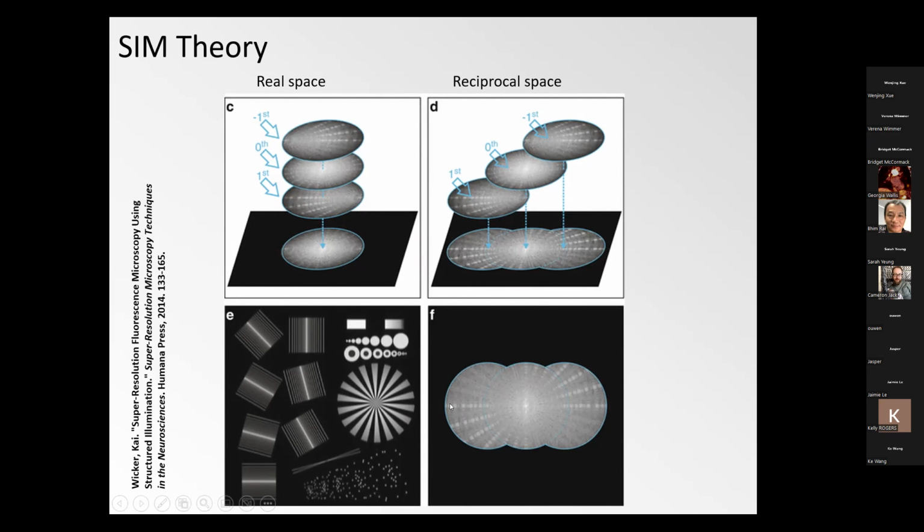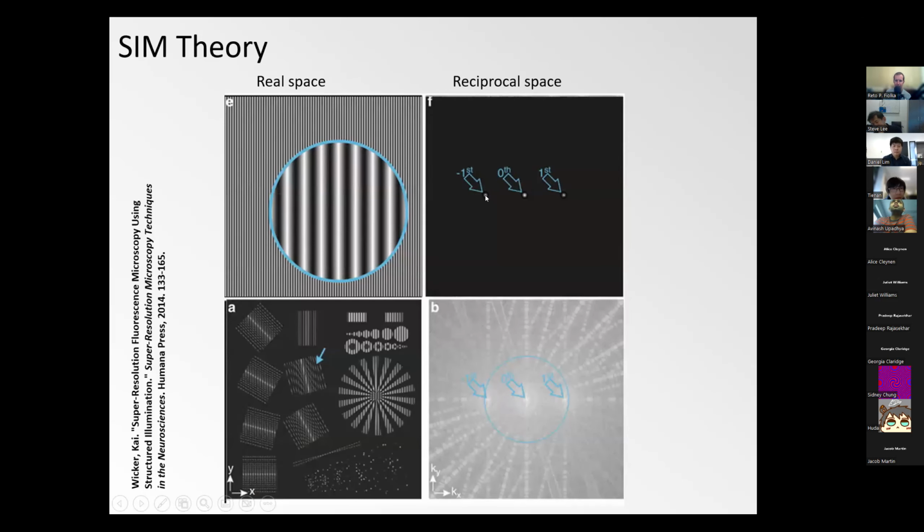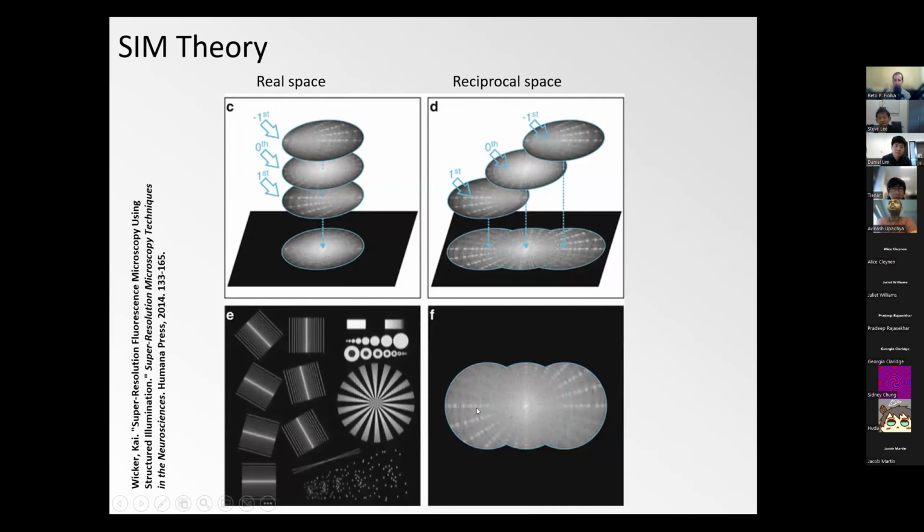So you get additional information out to here. And if you measure it, if this is kind of the normal distance to the cutoff frequency, apologies, it can in most cases go out twice as far. Why can it go about twice as far? It essentially depends on how fine that fringe pattern can be. So the finer the pattern here, the further out these dots are, and the further out the shifted copies are. However, that fringe pattern also obeys the diffraction limit. So usually these Fourier components or these frequencies also reside within the Abbe diffraction limit, or at best they can be at the border, and that causes this doubling because the location from where they came sits here at the border, and then you add this additional information.